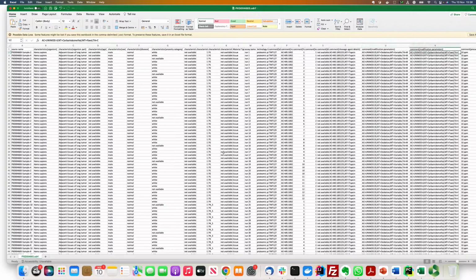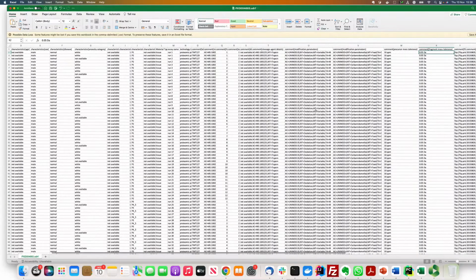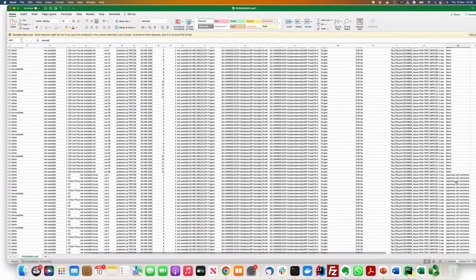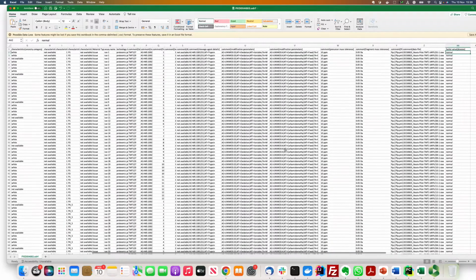Also, for a DDA experiment, it's really important to have the fragment mass tolerance and the precursor mass tolerance, because this will tell us how you can perform the identification, which peptide you can map to, and identify each spectrum in the raw file. And then you have the factor value, which in this case is the disease. All these samples and raw files are normal, and then you have the condition here, which is squamous cell carcinoma.